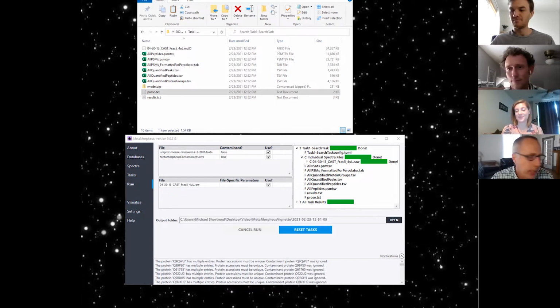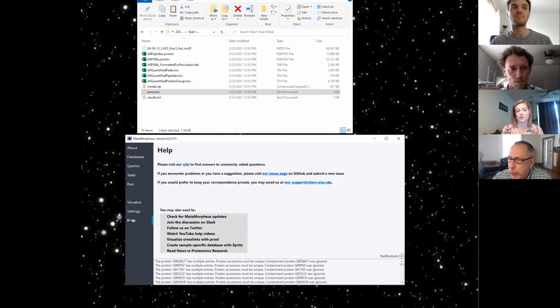One last thing before I go: I want to show people the help over here on the left. The way we feel about MetaMorpheus is that we're not going to be out there telling people how great it is and that you should switch and use it. That's not our deal. Our deal is that for the people who are using it, we pour all our time and effort into making sure they are successful.